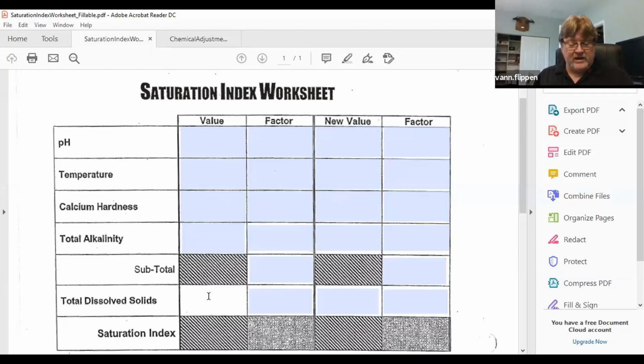But there's also a third reagent inside of your test kit that nobody really uses, and it's reagent number 3. What I would do is, to that same sample, I'm going to add 5 drops of number 3. 1, 2, 3, 4, 5. So I've added 5 drops, and there is no color change. So my free chlorine reading was 4.0, and my total chlorine reading is 4.0. Both those numbers are the same. So 4 minus 4 is 0. That means I have 0 combined chlorine.